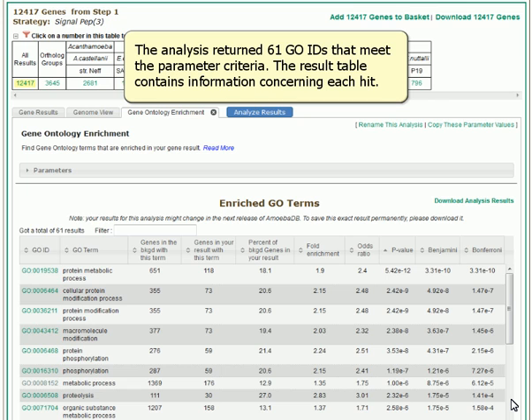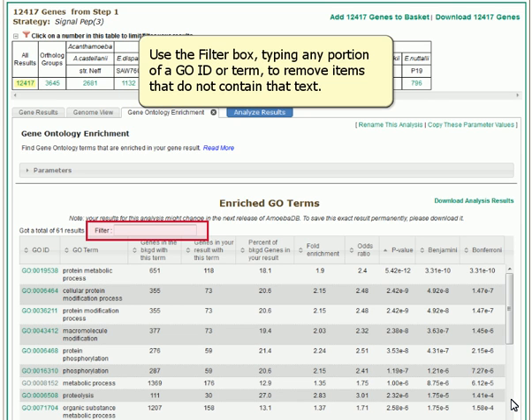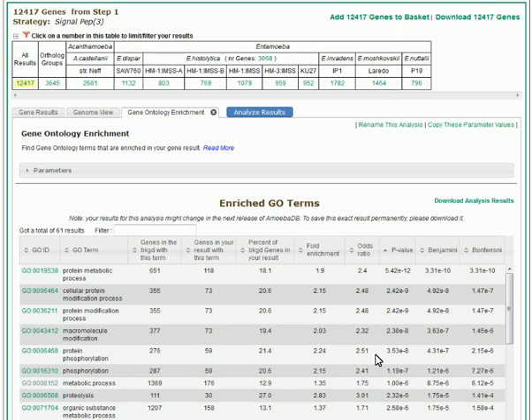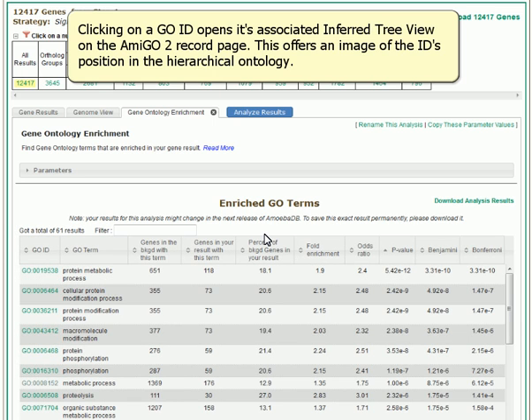The analysis returned 61 GO IDs that meet the parameter criteria. The result table contains information concerning each hit. Use the filter box, typing any portion of a GO ID or term, to remove items that do not contain that text. Clicking on a GO ID opens its associated inferred tree view on the Amigo2 record page. This offers an image of the ID's position in the hierarchical ontology.